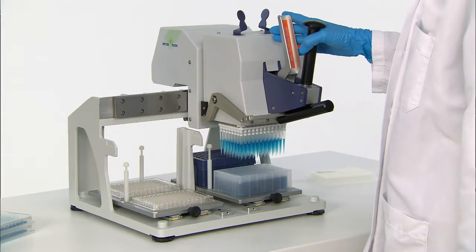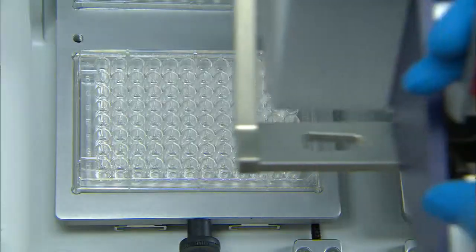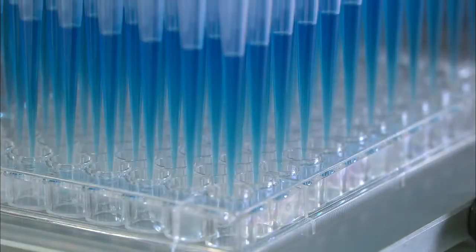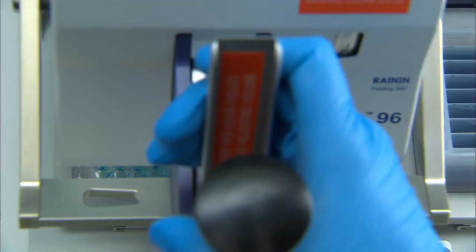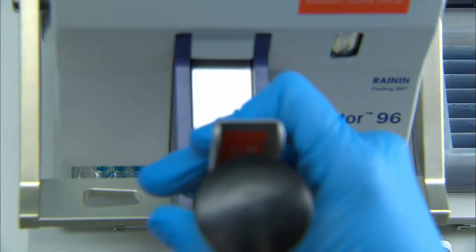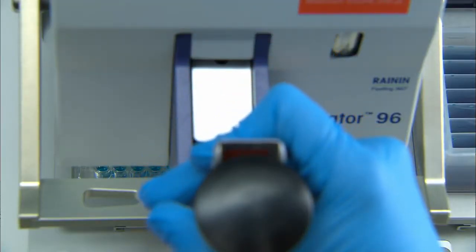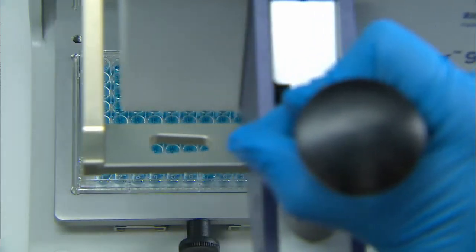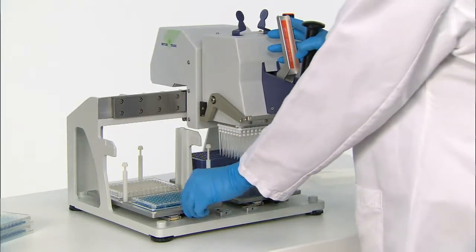When the liquid is aspirated, slide the liquid head to the left over the 96-well plate and push it down. Gently squeeze the lever again to dispense the liquid into the 96-well plate. Squeeze the lever one more time for the blowout step.